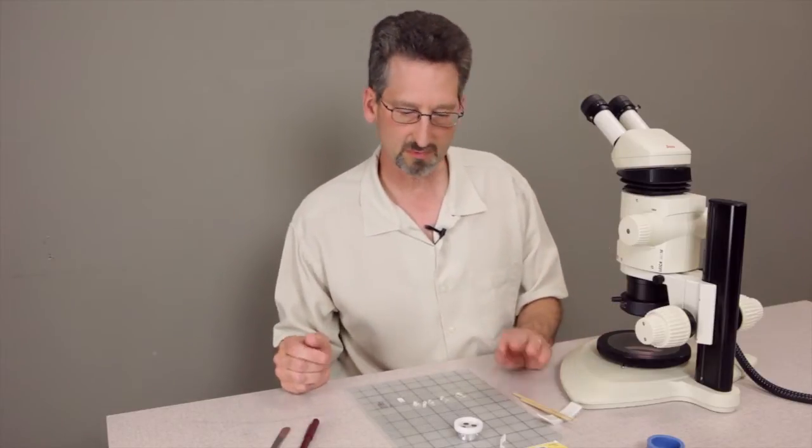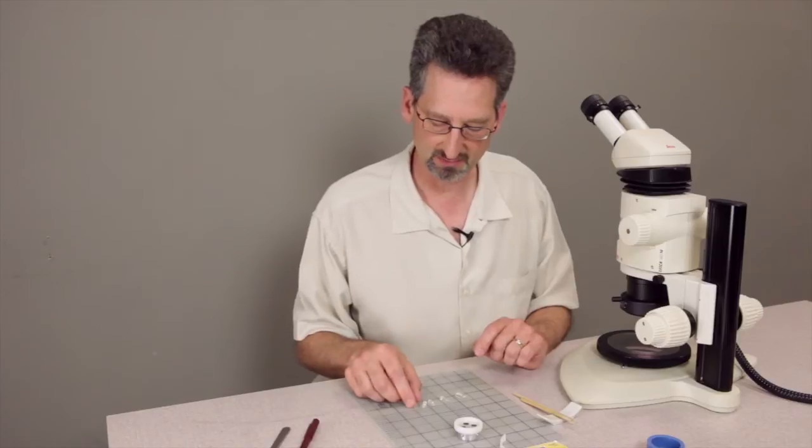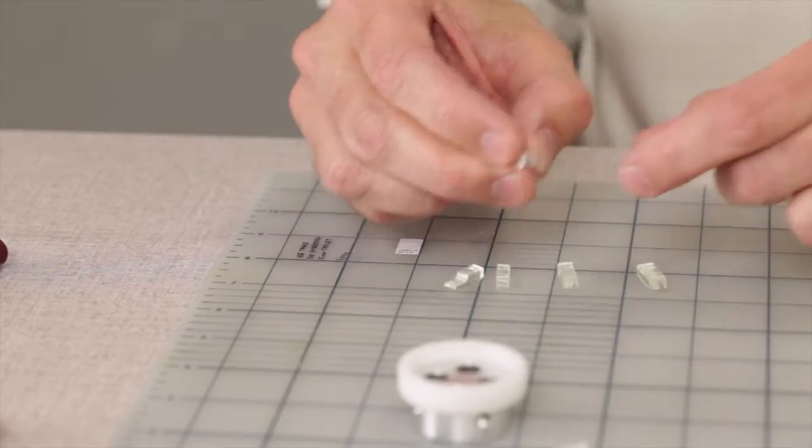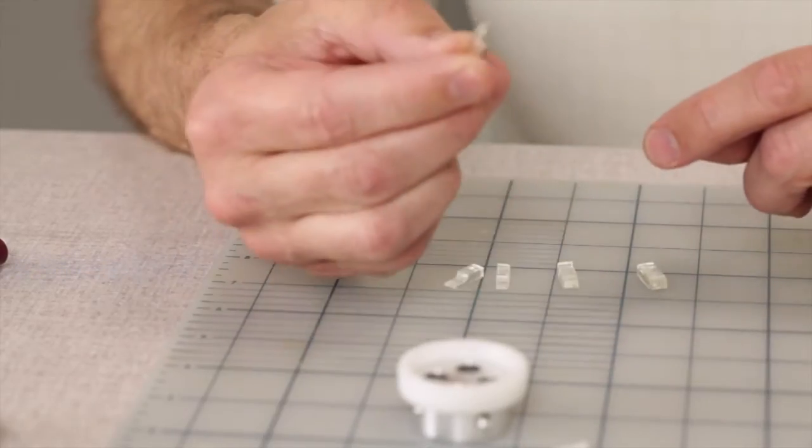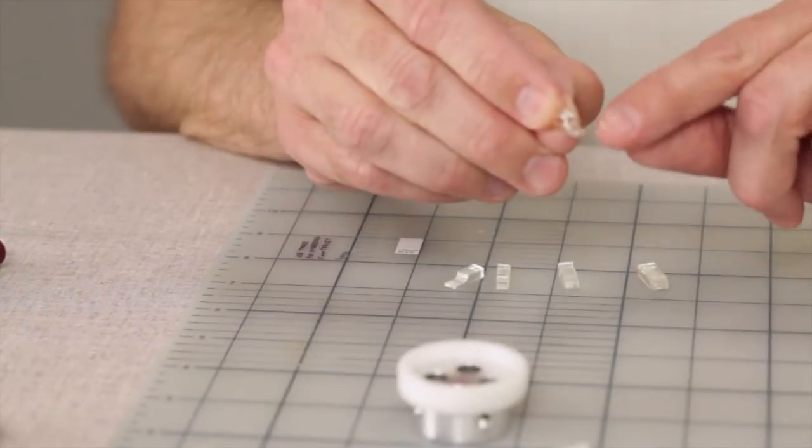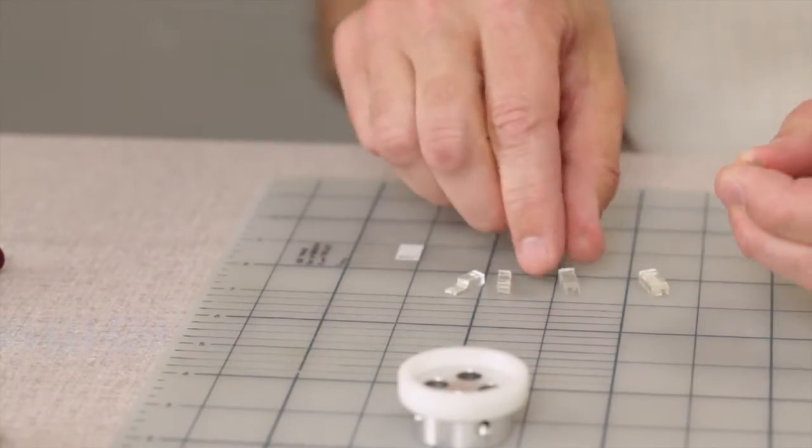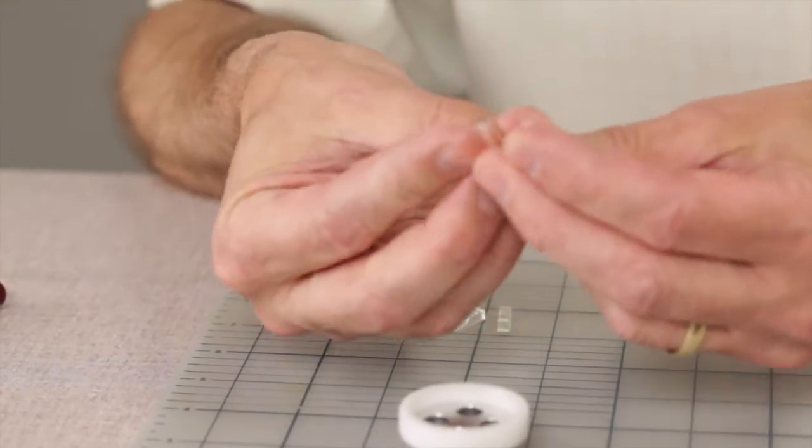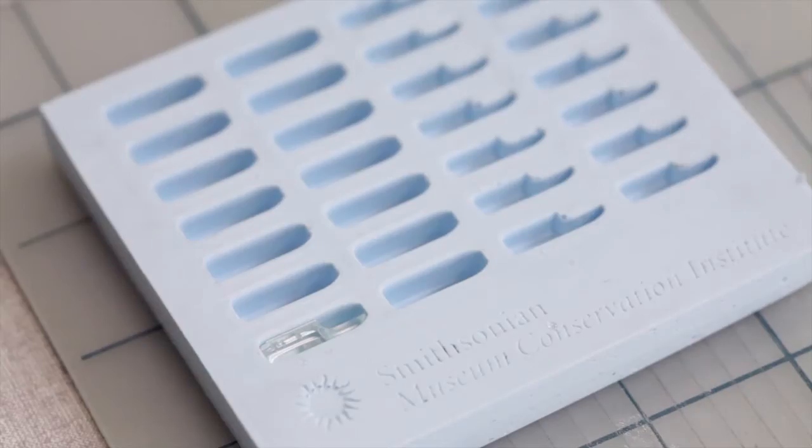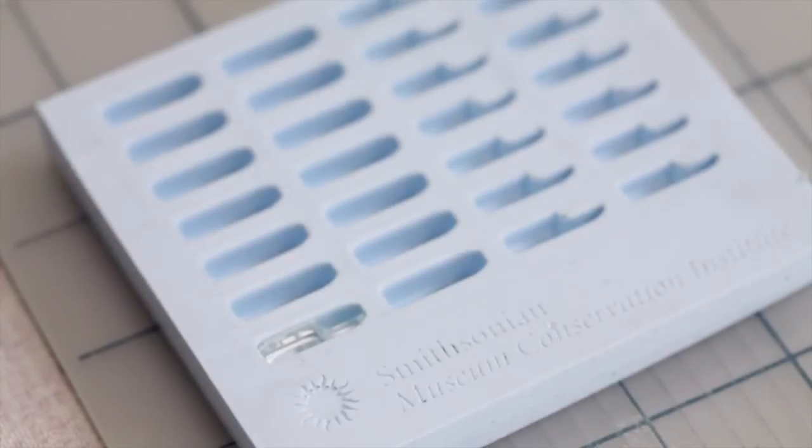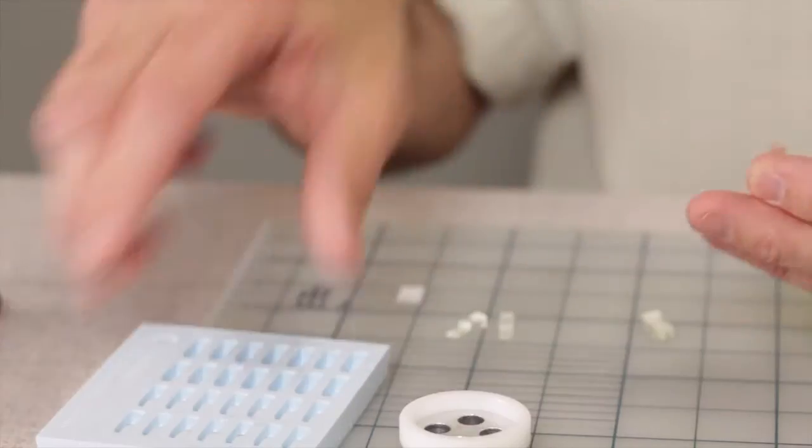The first concept is that we'll have a small sample that will fit on the shelf of this first form and then after casting in a mold like this we'll have the full-sized tablet that fits in the holder.